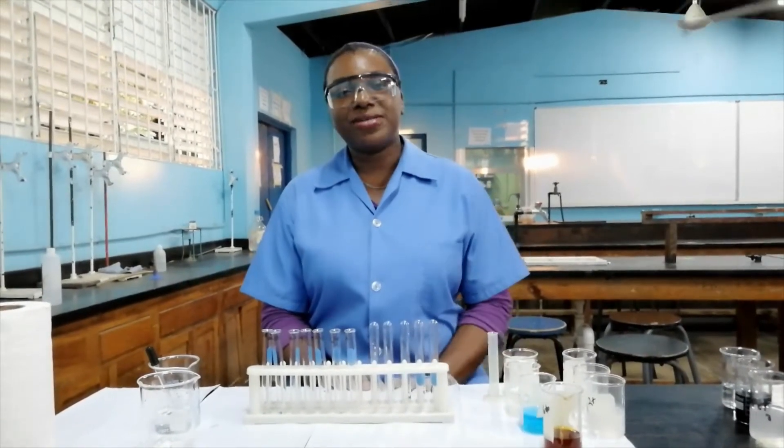Hi everyone. Today we'll be testing for cations using sodium hydroxide. I'll now display the different tests that we'll be doing on the screen.